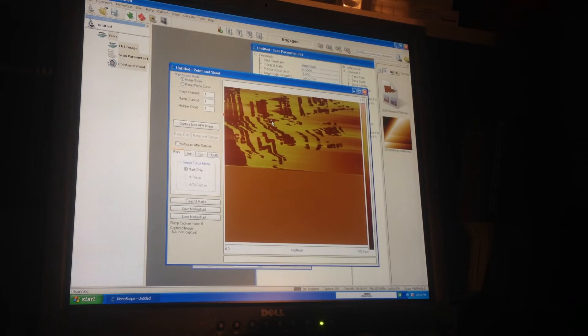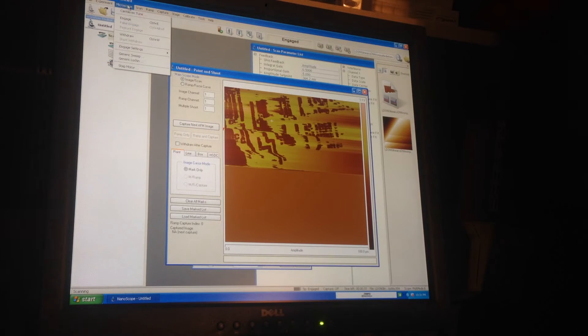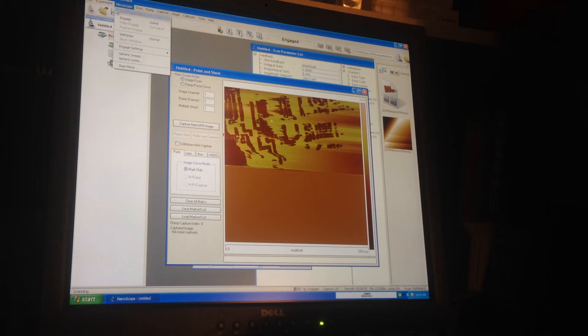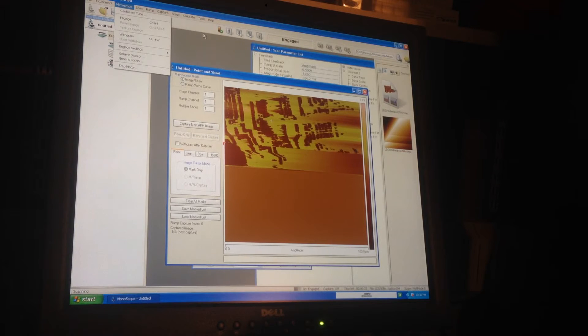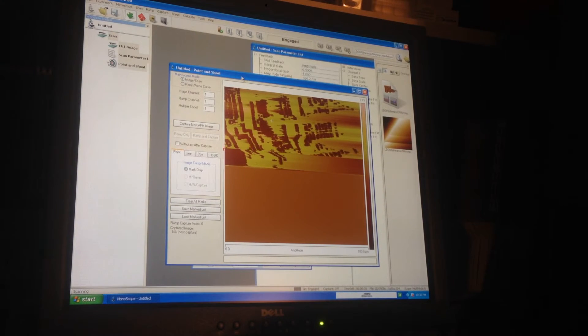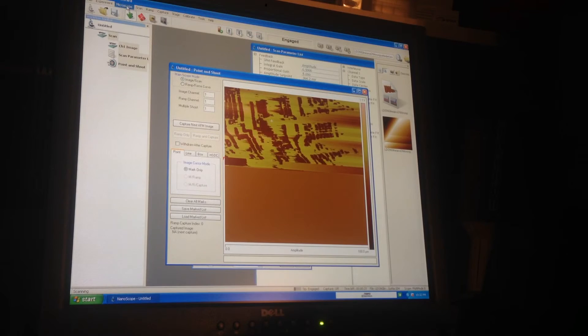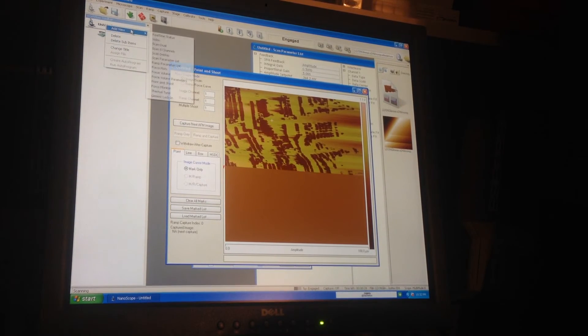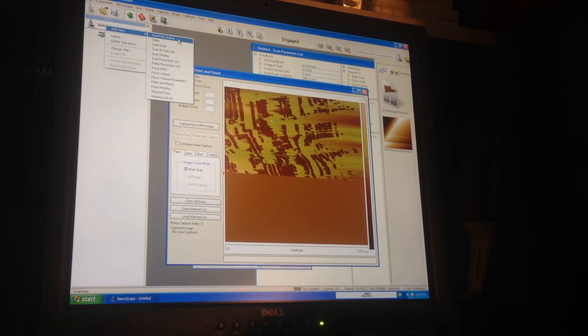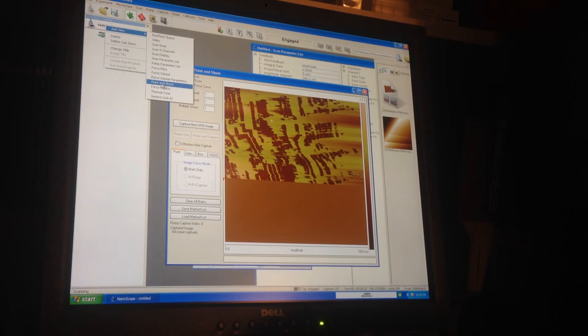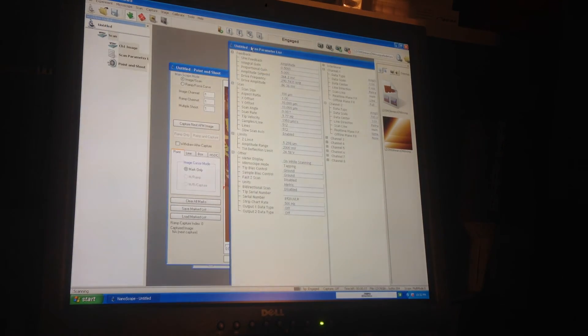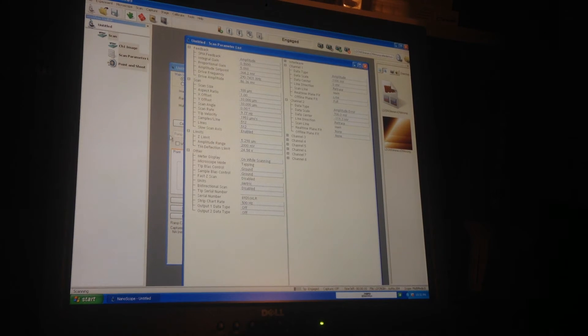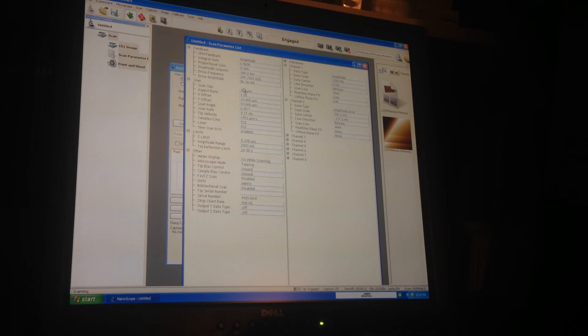That's the basic process. You can select the defaults and then cantilever tune and then just hit auto-tune to tune the cantilever. Then right-click on this untitled thing and add real-time status, point and shoot, and scan parameter list is the important one because that gives you all of the parameters that you can change, so you can change like the scan size and obviously you've got a really large range that you can go over.